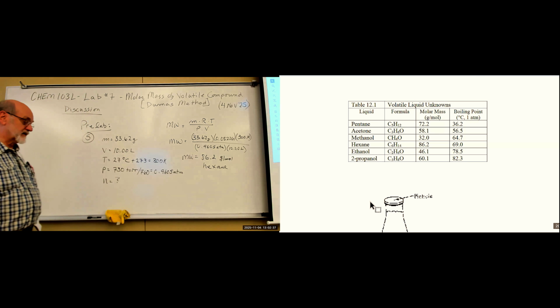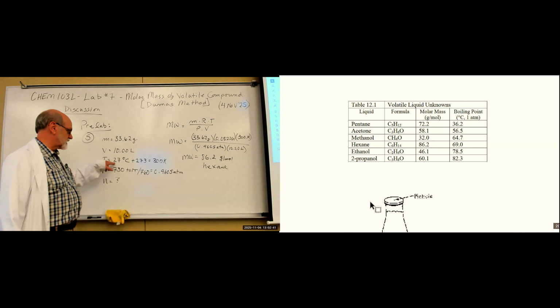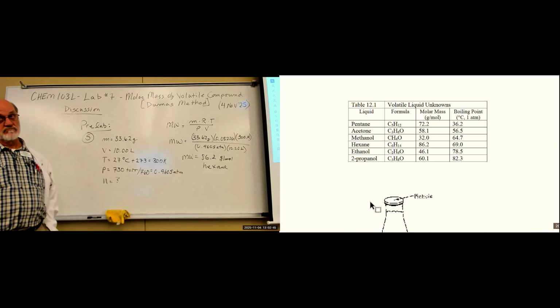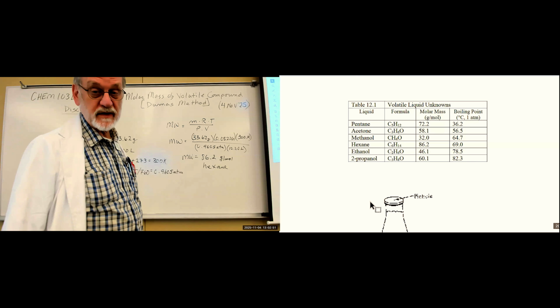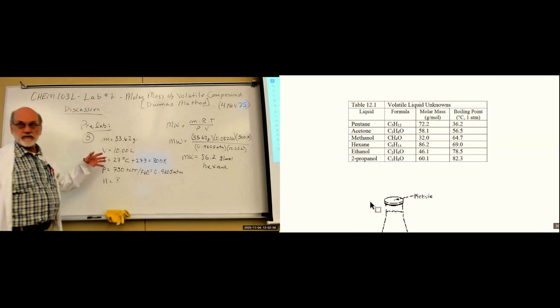Now, I wonder myself, if that's hexane, is it still a gas at 27 degrees? Hexane's volatile, yeah. But what's the boiling point of hexane? 69 degrees C? Okay, so that throws a wrench in the gears for this problem.